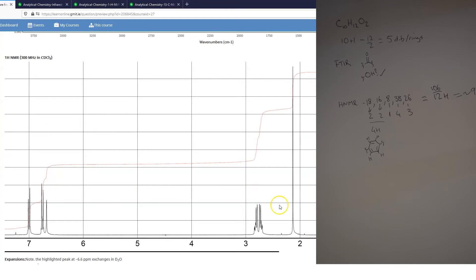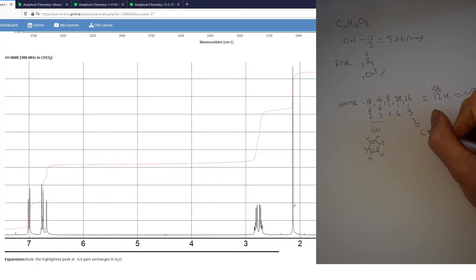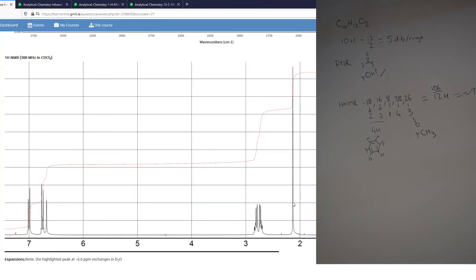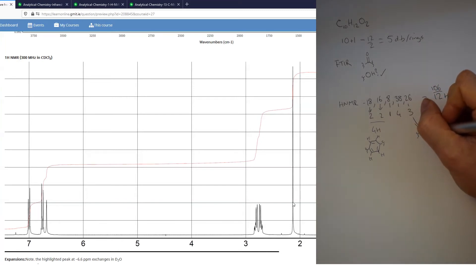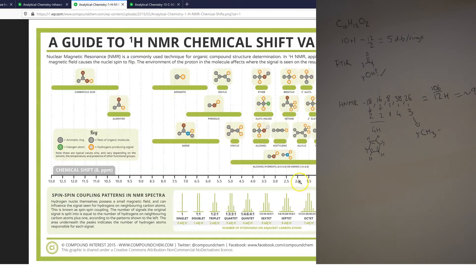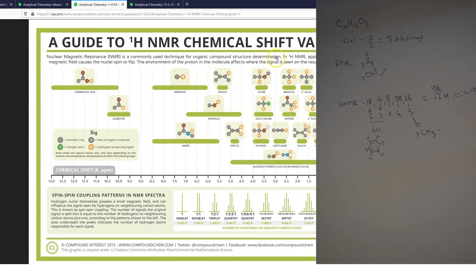Going back to the main spectrum: there's a singlet that integrates for three protons. If you have a singlet integrating for three protons, unless your molecule has three identical CH groups with no attached neighbors, it's very likely a CH3 with no neighboring hydrogens — attached to something with no adjacent hydrogens. Since its chemical shift is about 2.1 ppm, and things between 2 and 2.5 ppm are typically attached to a ketone or directly to an aromatic ring, it must be attached to one of those.